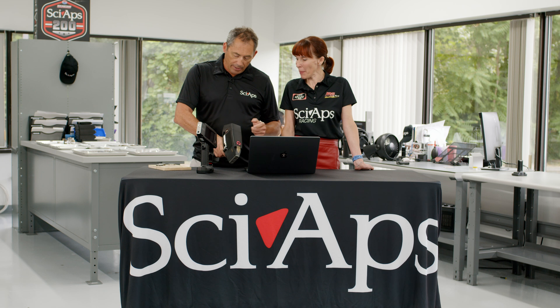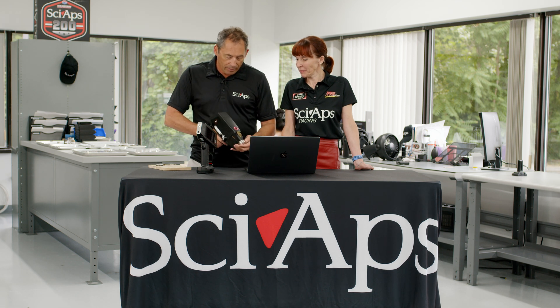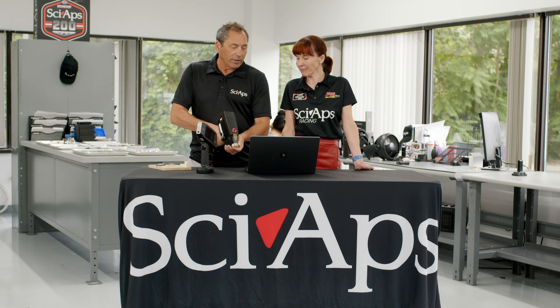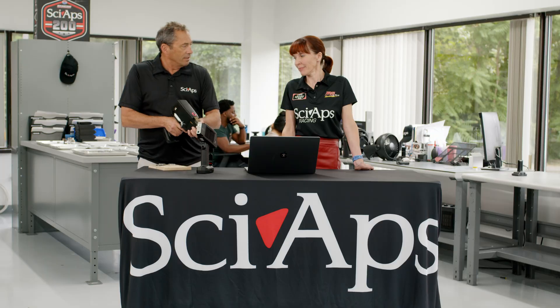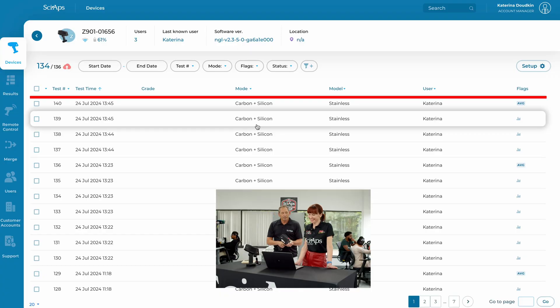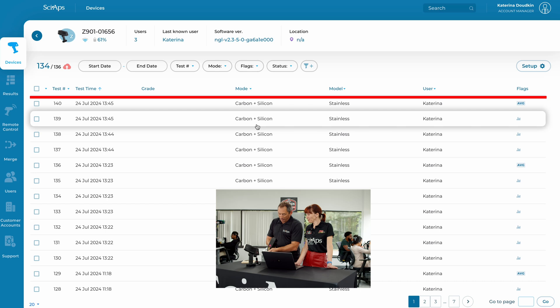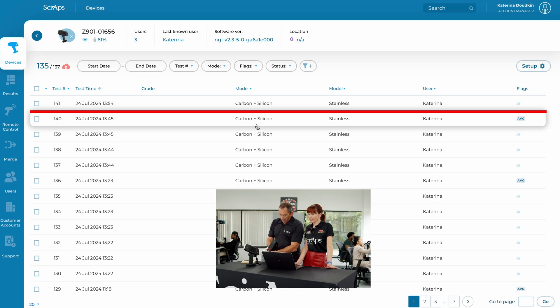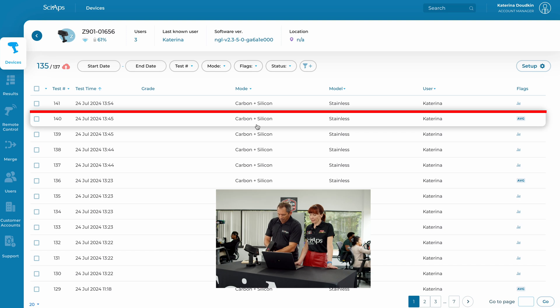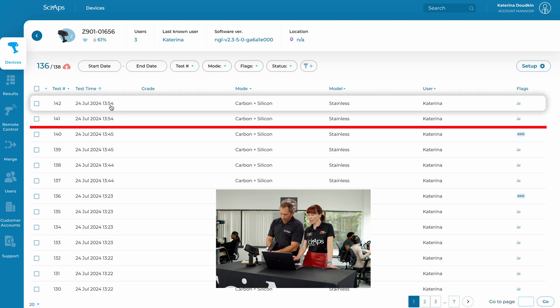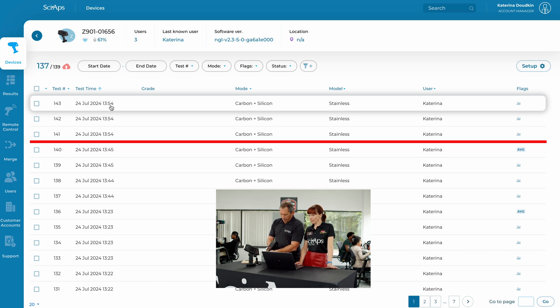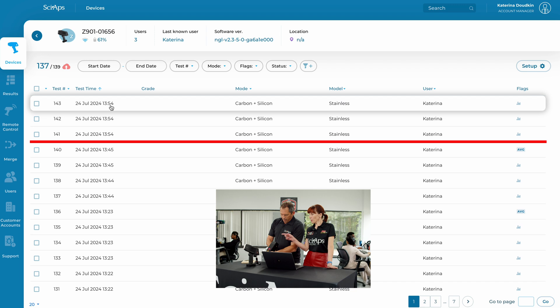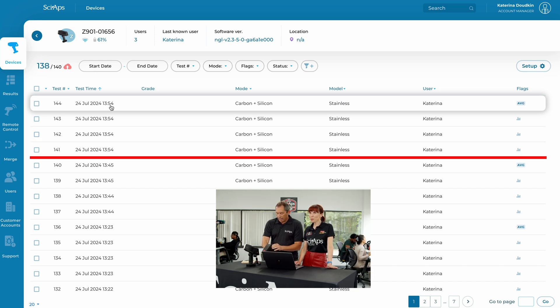Turn it on, hit analyze. All right, so we're going to see a test pop up there in real time, right? See, there's no cables, nothing going on. This is a L-grade. I don't know what this is. Come on in. All right, so I'm going to do three tests. It's reading. 133. Reading, yep. You have to press save button. Press save button. Thank you. I always wonder how to use these things.